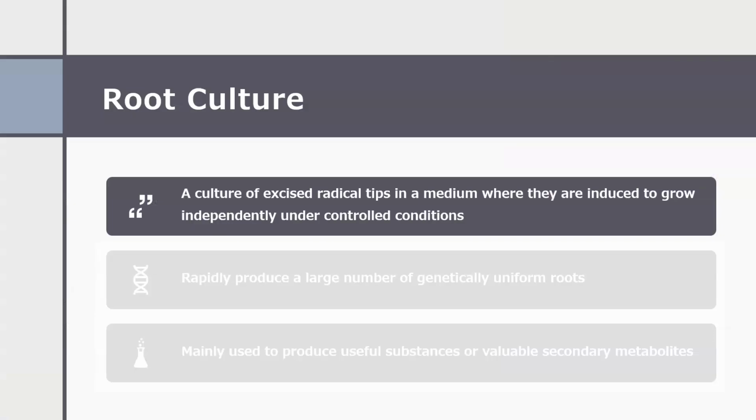Root culture can be established in vitro, using explants from the root tips of either primary or lateral roots, which can be cultured independently on relatively simple media. Since roots are indeterminate organs, their growth in vitro has the potential to be unlimited.